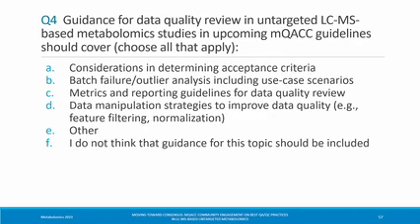This is a little bit of a side, but pulling in some information that I've learned from the pharma industry, who do lots of real-time monitoring and quality assurance, quality control. They use reference material a bit more like a system suitability, where they've got specific compounds that provide a diagnosis of the instrument state. So, for example, compounds that show that the column is performing well, show that the ion transmission is performing, show that collision energies are doing as expected when they're acquiring MSMS spectra.